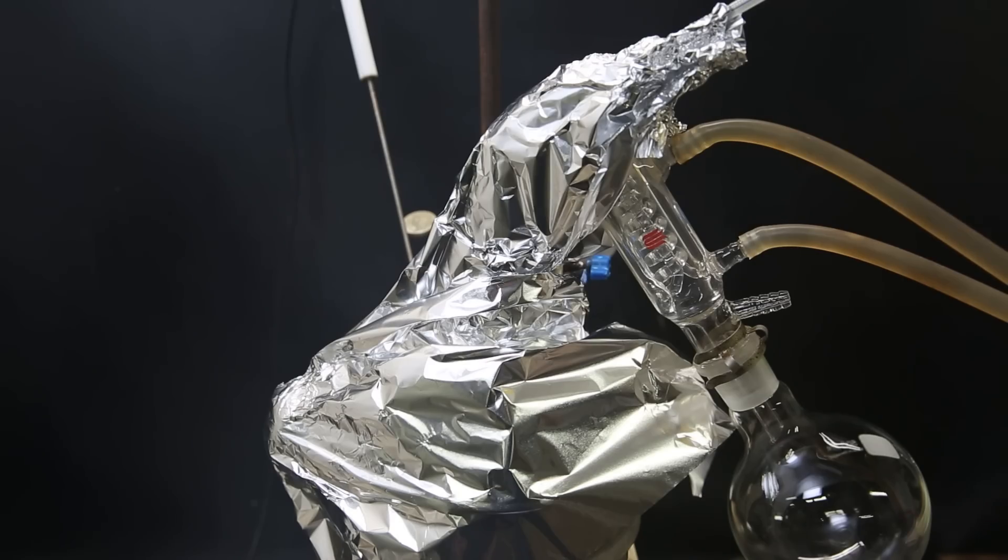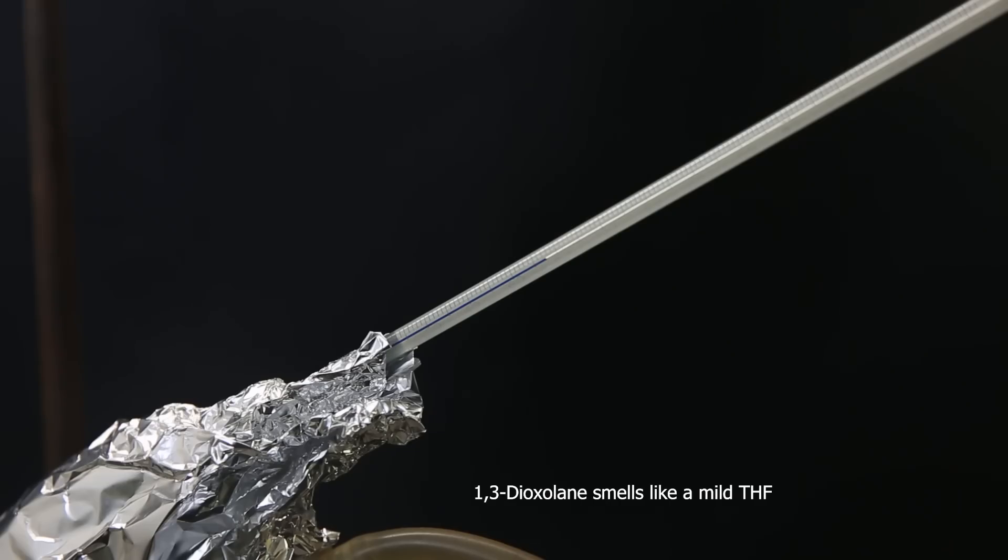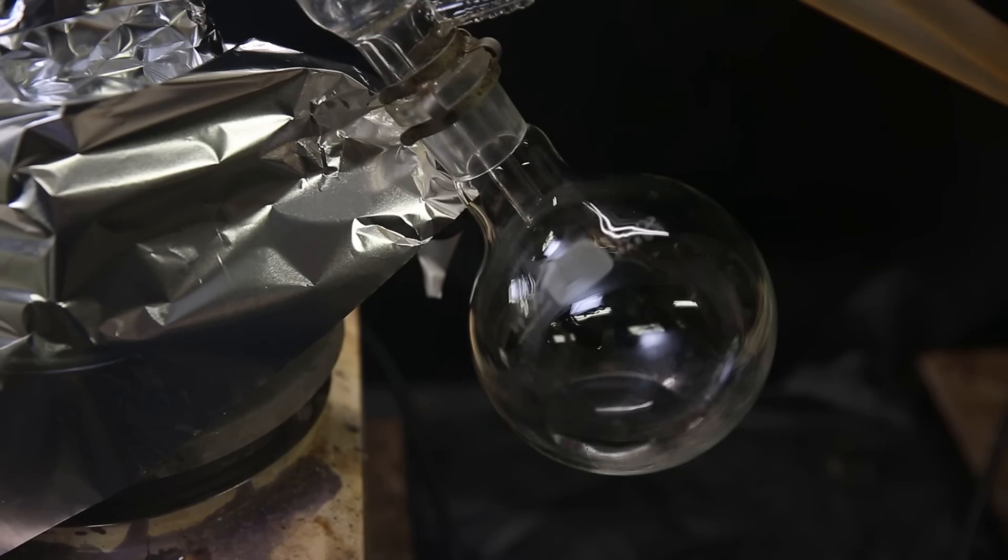The first bit that distills over, I discard, since it likely contains impurities, and it smells more like acetaldehyde. I then keep collecting the distillate around 74°C, and it steadily comes over.